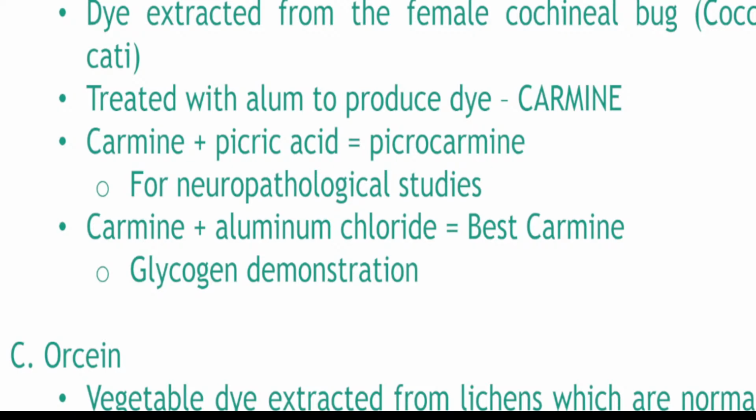Pag nagpunta kayo sa Baguio, nakikita niyo yung parang mga puti na patches dun sa tree. Kinukudkod yun, class. Tapos, nilulublob yun sa ammonia. Yung powder na galing dun. Nilulublob sa ammonia. And then, pinapahanginan yun after several days. Tapos, orcine ang tawag dun sa ganun. Okay, lichens. Hindi yun yung Bacillus licheniformis, class.